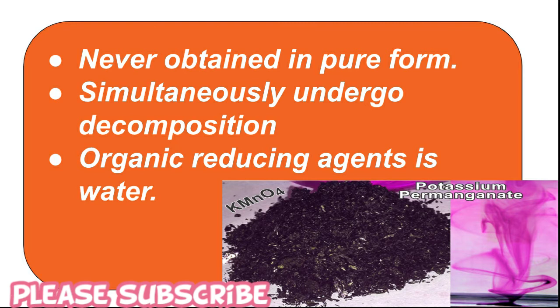The second problem is that KMnO4 spontaneously undergoes photodecomposition. As a result, its strength always changes. Again, ordinary distilled water always contains some amount of organic reducing agent, and these organic reducing agents are oxidized by KMnO4, and the KMnO4 is reduced to MnO2.